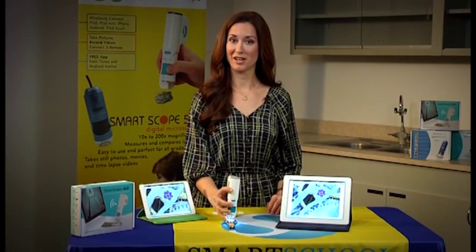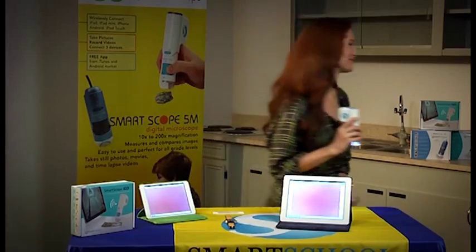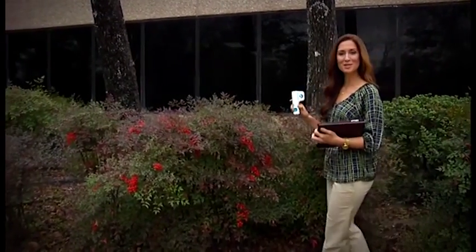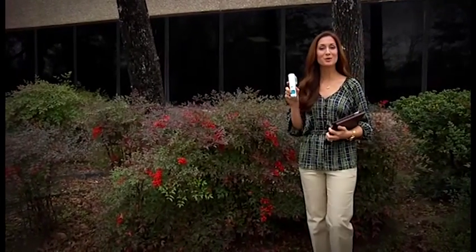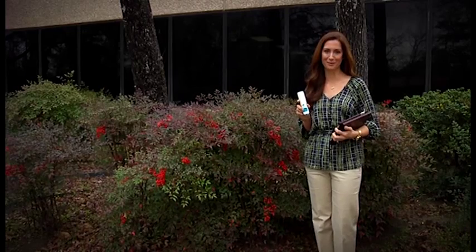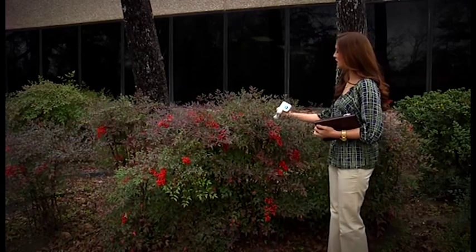And because the SmartScope iGo is wireless, you can take it with you anywhere. It doesn't get any easier or more convenient than using the SmartScope iGo in the field. This is a great tool to take with you so you can observe specimens in their natural environment. The SmartScope iGo lets you take pictures and record video. The three mobile devices connected to the SmartScope iGo can also take pictures or record videos independently of one another, so while one student is taking a picture, someone else can be recording a video.